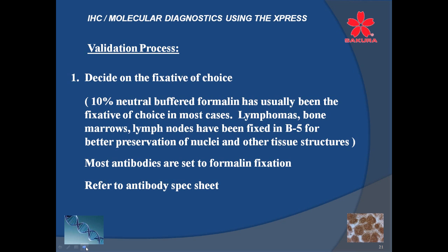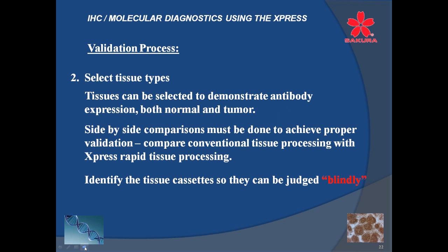And because of that reason, I think we probably ought to adhere to formalin as much as we can. I will tell you that the time is fast approaching that we will probably not be into that era of formalin, but we'll talk more about that when I get to the molecular stage, so you'll see what I'm referring to there.